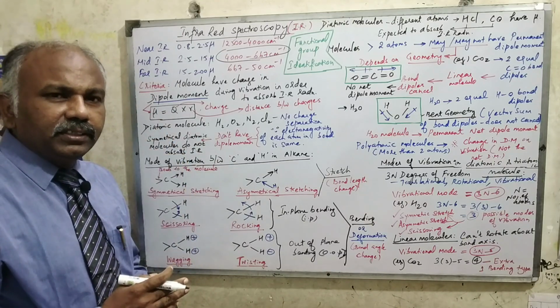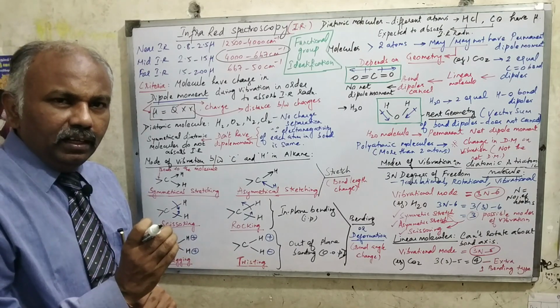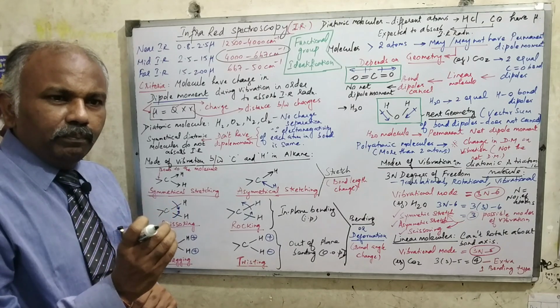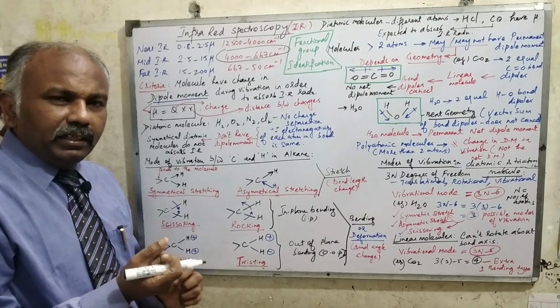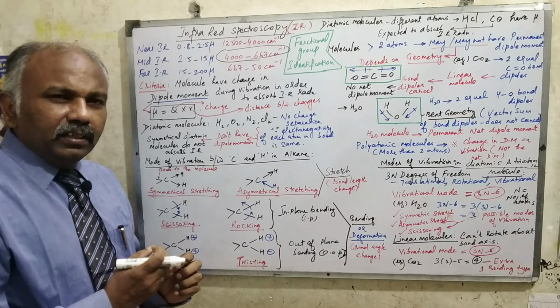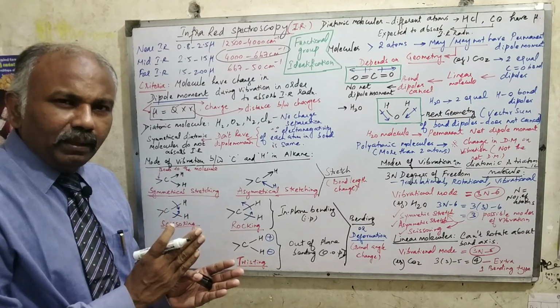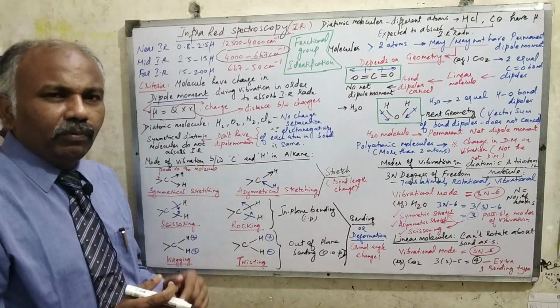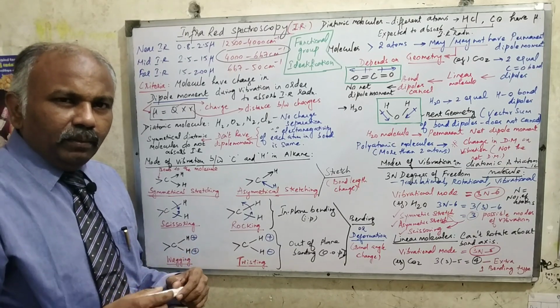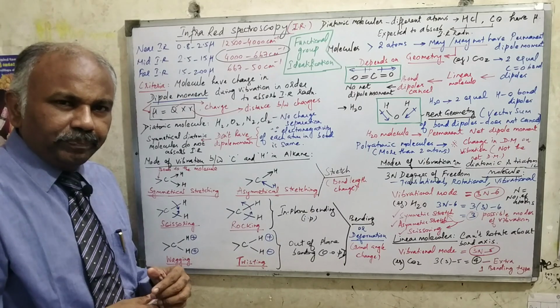Whereas the near IR region is basically used for identifying packaged material, particularly clinical packaging supplies, raw material packaging, or any material which is analyzed in a non-destructive manner. Without opening the packet, if you want to analyze the spectral characteristics, then we go for near IR spectroscopy, particularly with excipients and other aspects.